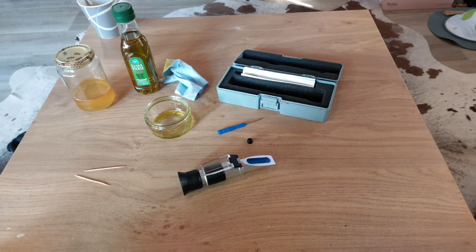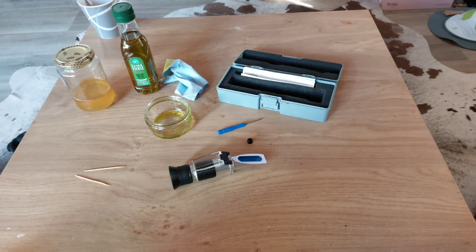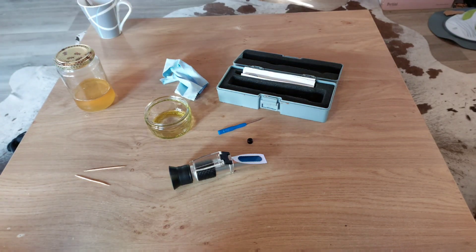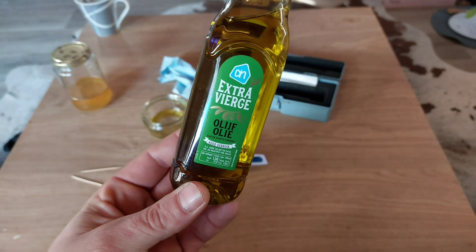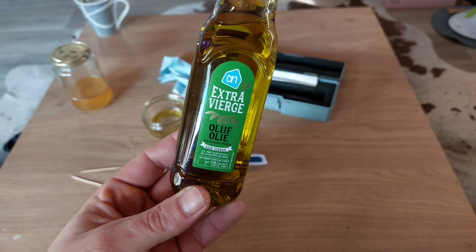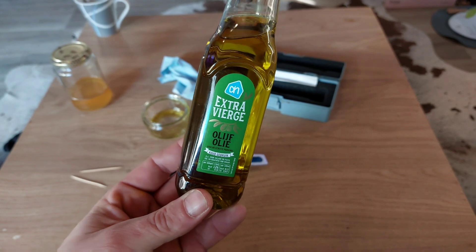Normally to calibrate your refractometer, you use some kind of calibration fluid, which is mostly a honey with a known moisture content. But you can run out or it can crystallize. There is a hack using something most people have in their kitchen cupboard — that is extra virgin olive oil.